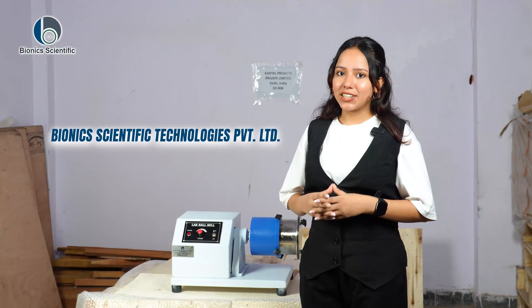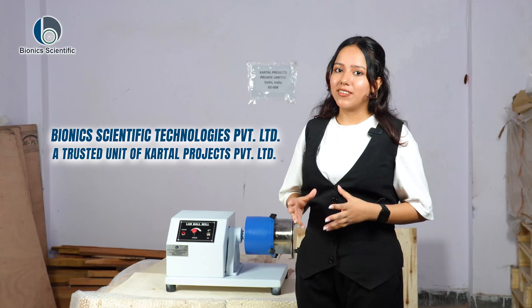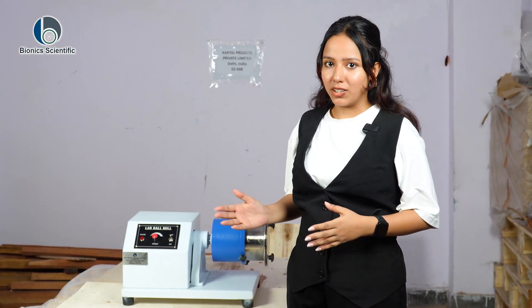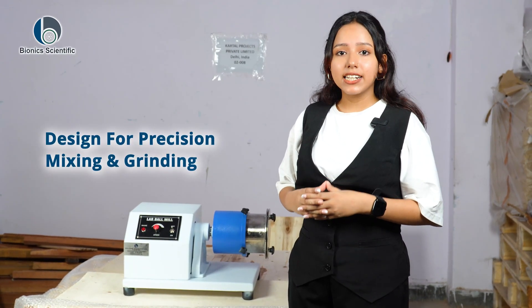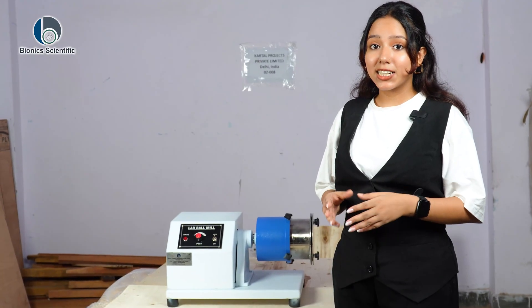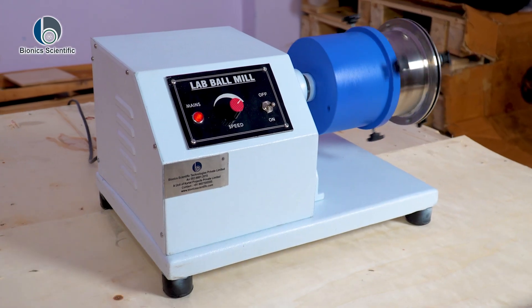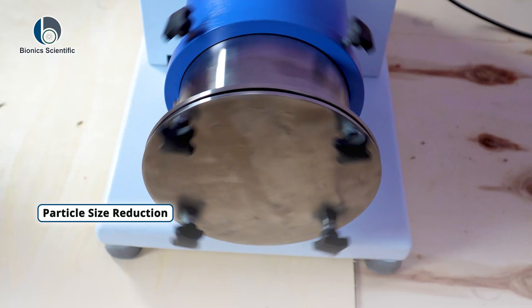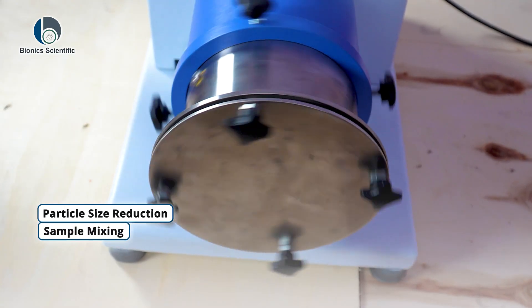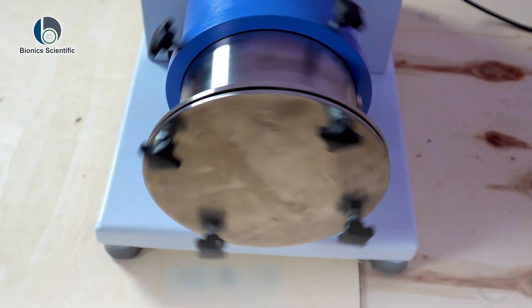Welcome to Bionic Scientific Technologies Private Limited, our trusted unit of Cartel Projects Private Limited. Today we are excited to introduce one of our most efficient lab tools: the 2kg lab ball mill, designed for precision mixing and grinding for lab and general testing purposes. It is mainly used to make powder from solid materials by breaking them down into finer particles. It's perfect for particle size reduction, sample mixing, and homogenizing materials in a controlled lab environment.